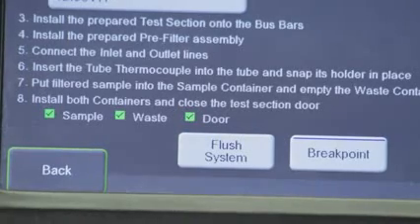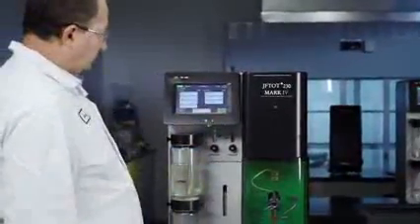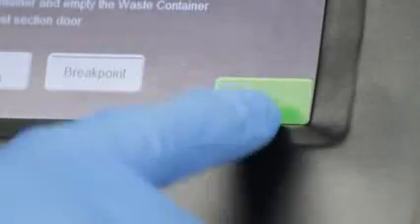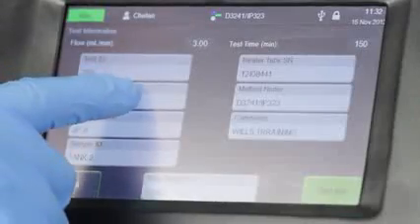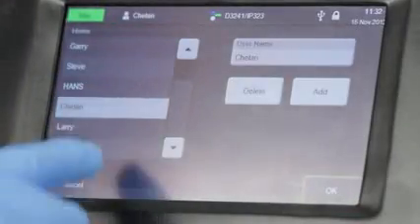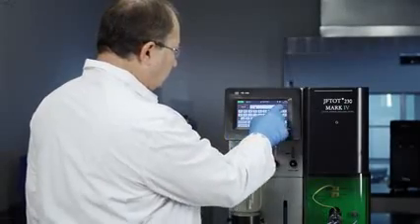You've now set up the JFTOT 4. Now you can start the test, which will only take a few more steps. The first step is to press the next button. Once you do this, the test information screen appears. On this screen the user will enter the test information for the sample and select the test method. Once you get all the information entered, press the start test button.